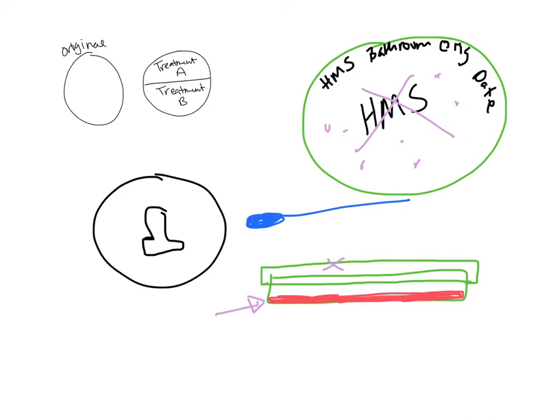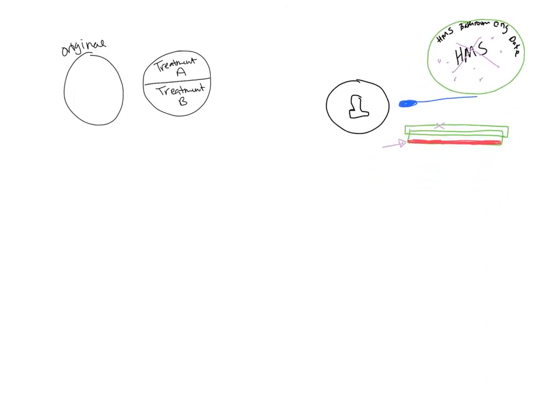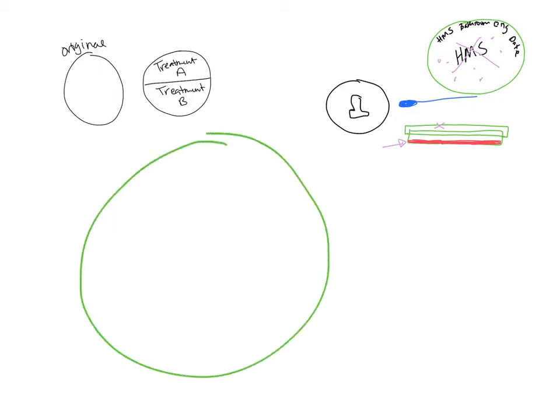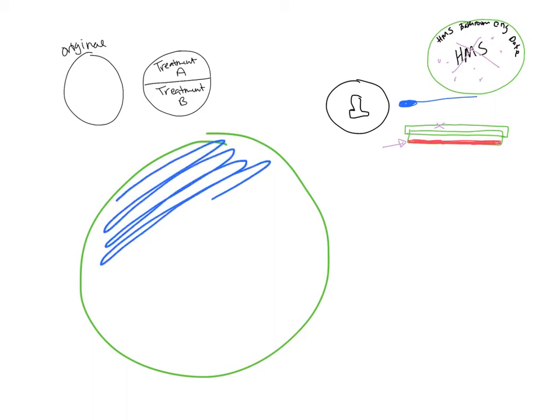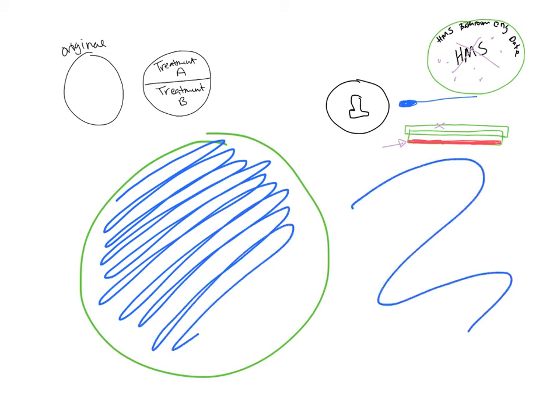All right, so you swipe your surface, and then you take the lid off, and if you can, don't even remove it completely. You'll just crack the lid open, then take your swab and do a very simple plating. There are more sophisticated ways to spread out the bacteria. You'll learn those in microbiology. But what we're going to do is take your swab and just spread it across the surface. You don't want it to just be like that. It's not going to spread it enough, but that should be sufficient.